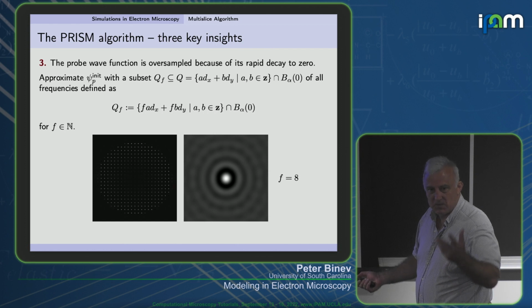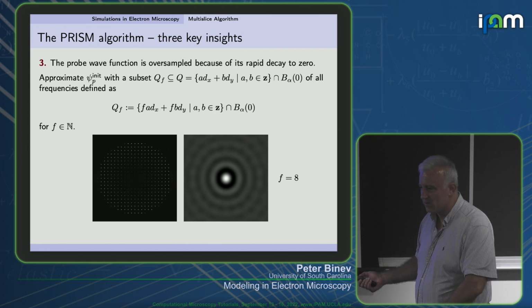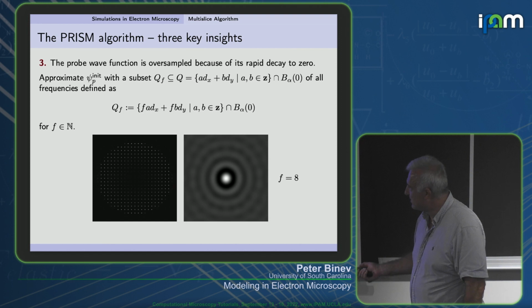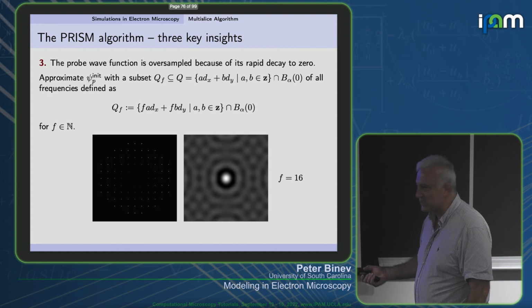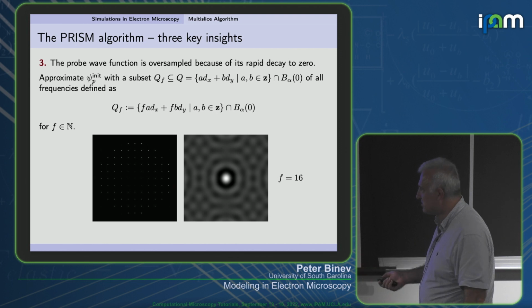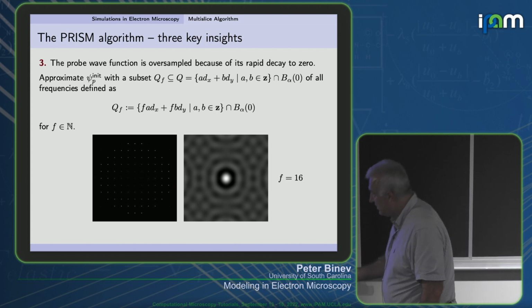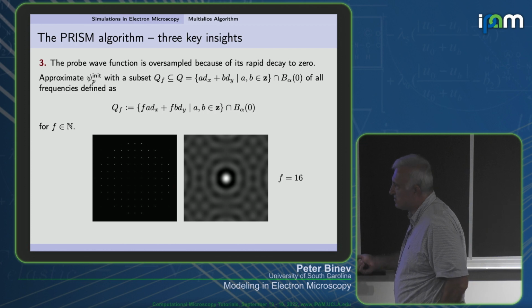From all experiments, Christian can confirm or decline that, but usually f equals 4 is kind of the optimal. F equals 8 is already a little bit too bad. And of course, if you go to 16, you see that this is not what you want to put as an input, so the error becomes too big. And the number of coefficients you use is very, very small, so you can use fast calculations for something which is not really important.